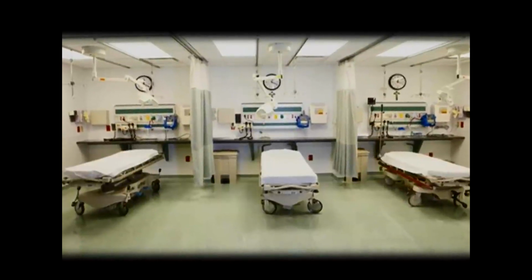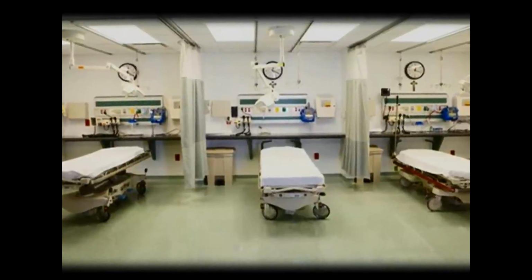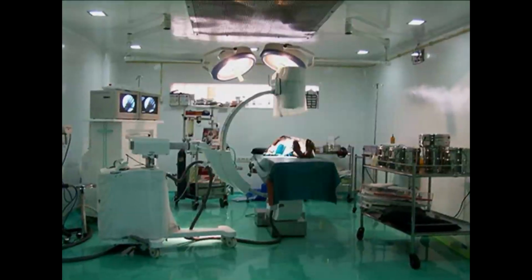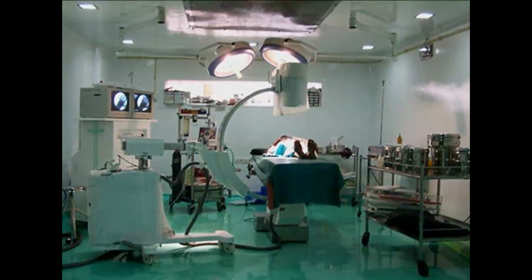So this is the mode of action of UV light. These UV lights are actually used in laminar airflows, in sterilization of open air in operation theatres. It has got versatile uses, but one of the limitations of UV light is its low penetrance, as a result of which only the microbes or contaminants present on the top of the surface or on the top of the air are getting sterilized. But the microbes residing beneath the surface are unable to be sterilized.